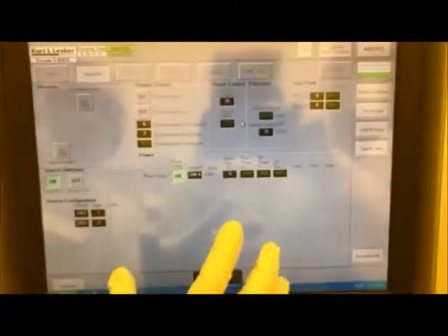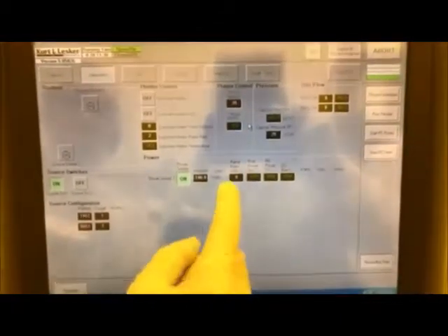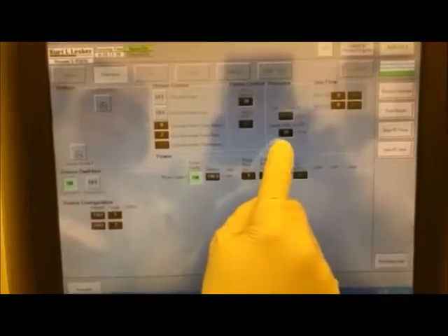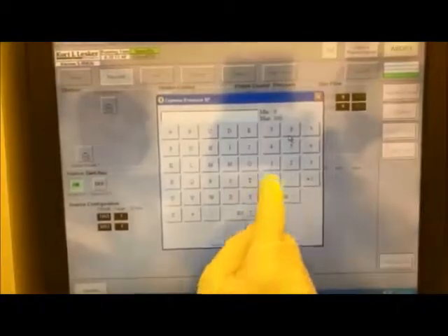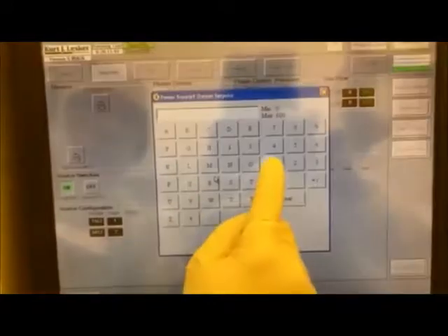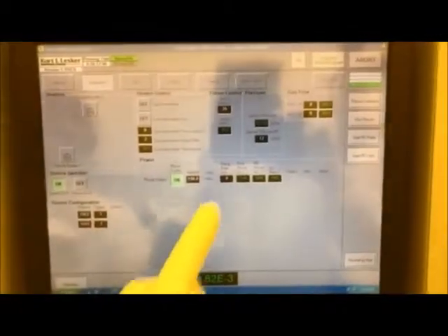Every time after you set the power, the ramp will go to 0. We have to set it back to 5 watts per second. And then we set the pressure. Again, from 25, we set it to 12, reduced by half. And then we come here to set the power to 150. You can see the power go up, pressure go down, and then check the plasma. Plasma still stays on, which is good. Once it reaches the pressure of 12 millitorr, and power is close to 150, once again we do the same thing.